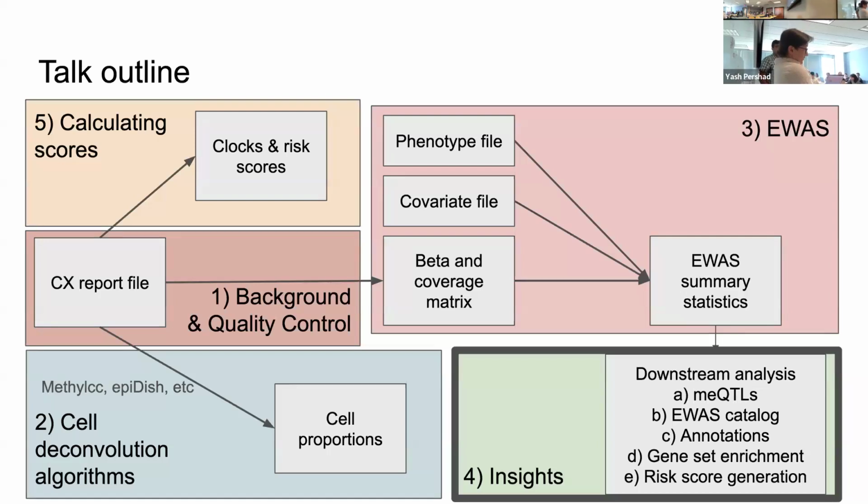Oh, that's a great question. So essentially, how much missingness can we handle? This is another thing that I really love about the Twist methylation panel. Before this, I worked with RRBS data a lot, and the missingness was super frustrating. It was very hard to deal with. This panel is very complete, which is awesome.